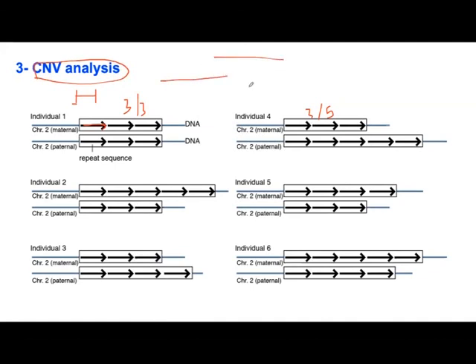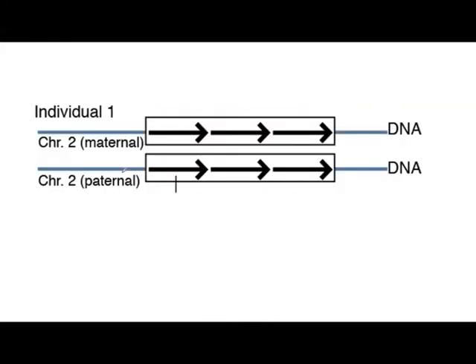But sometimes you do find that this repeat is actually very long. It's not a small repeat, it's actually a very big chunk of DNA that's being repeated. And here you're going to face a problem: your fragment analysis, or what is called HRM, and also another technique called MLPA, which we sometimes use for some of the repeats, does not work in that method. So the only way to do it is to use what is called real-time PCR.